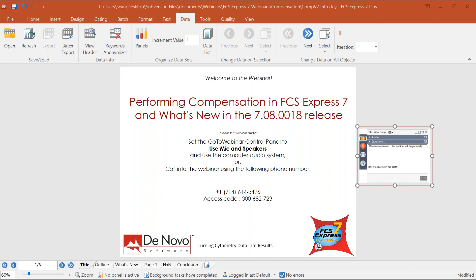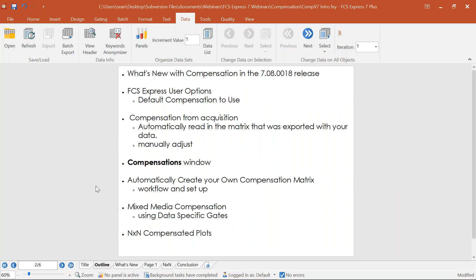Keep in mind that everything we're doing here in this webinar is pretty much applicable for previous versions as well. As an outline for what we're going to be covering today in the next half an hour to 45 minutes: first, what's new in that new release of FCS Express 7 as it relates to compensation, with great new tools and enhancements to make it easier.